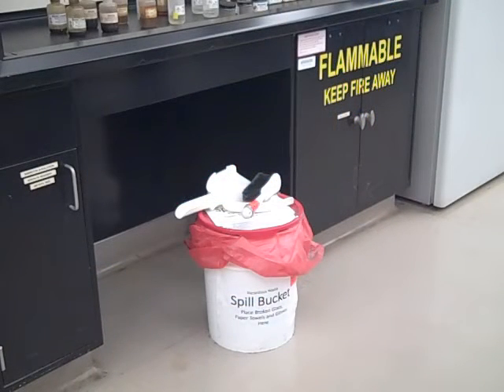If you break glass in the microbiology lab, please notify your instructor immediately. Broken glass will be cleaned up with a dustpan and broom and disposed of in the broken glass container.